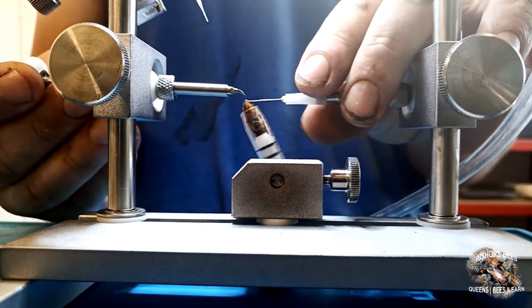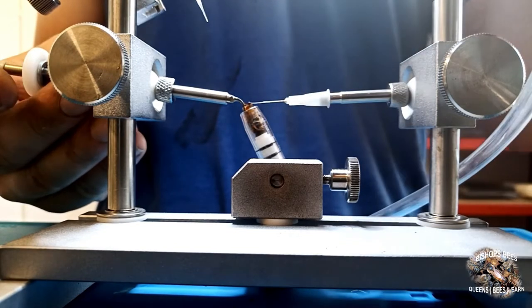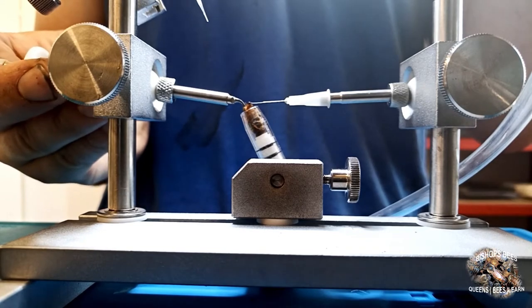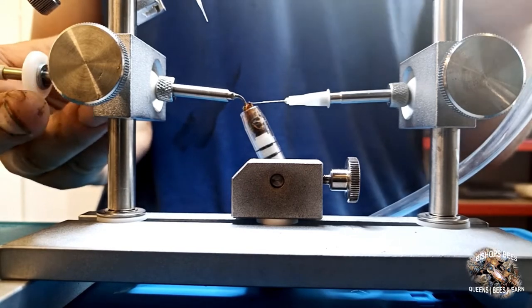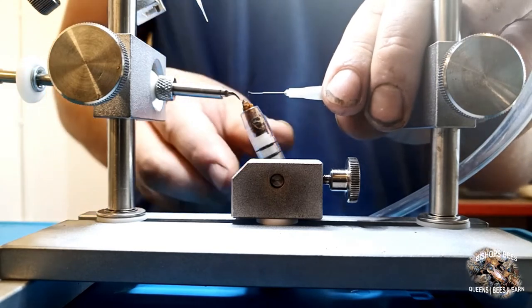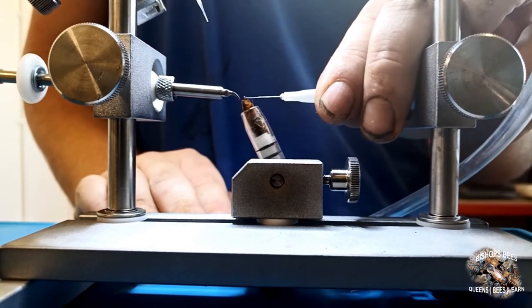The ventral hook is used to support the queen's ventral side and open up her sting chamber. This will give access to her genital opening and genital chamber. The sting forceps are used to gently clamp the sting to lift it out of the way for easy access for the insemination tip.